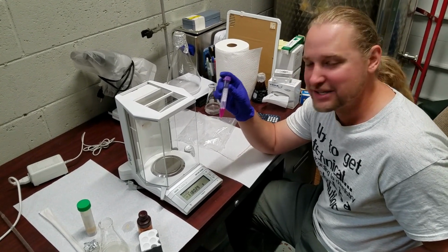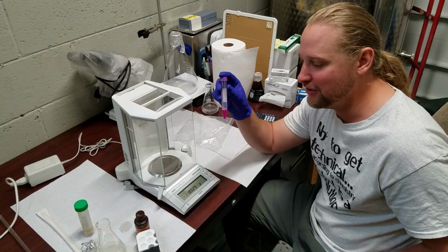You can go ahead and load this and count this under the hemocytometer and figure out how much yeast you want to pitch now. Well, there we go. Hopefully you enjoyed me showing you guys how to do a yeast dilution by weight in a brewery.